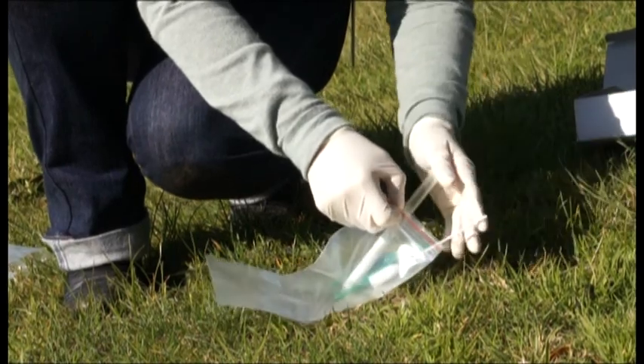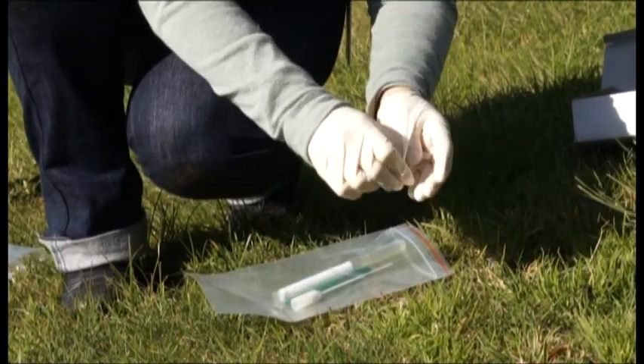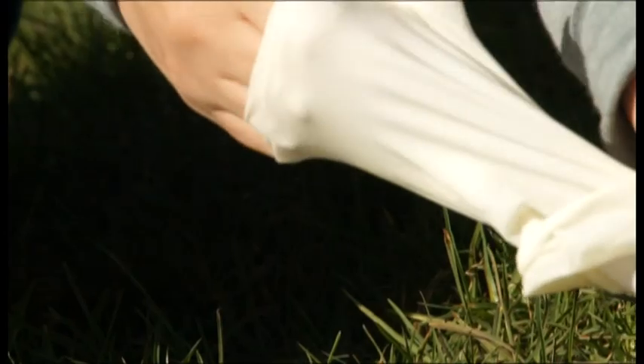Place the gloves, forceps and the swab protective case in a Ziploc bag for disposal when you return to base.